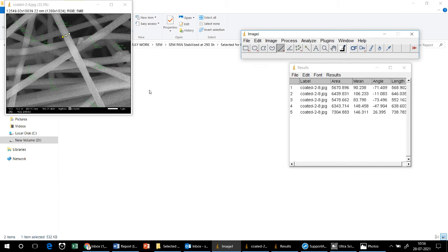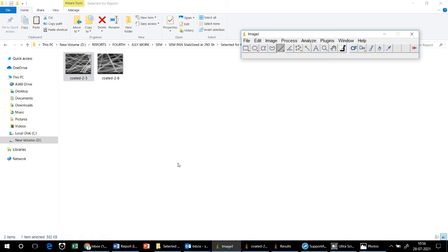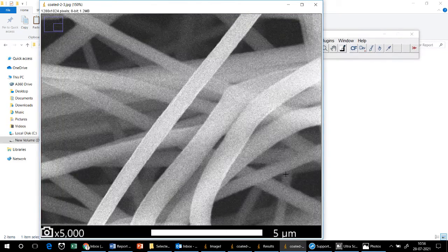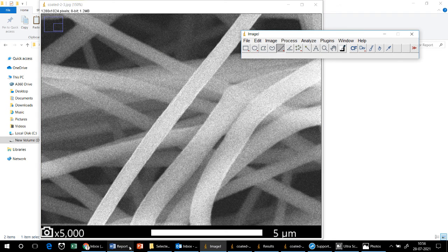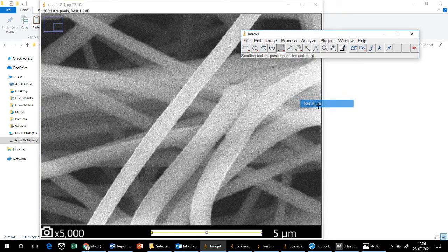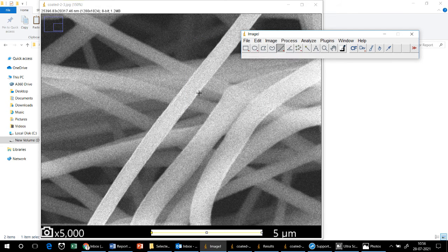Now I will load a second AFM image into ImageJ. Since this is a new image, I need to set the scale again. This image has a scale bar of 5 microns, so I press Shift and draw a line across that scale bar. Then I click Analyze > Set Scale — the known distance is 5 microns, which equals 5000 nanometers. I set the unit to nanometers and click OK.